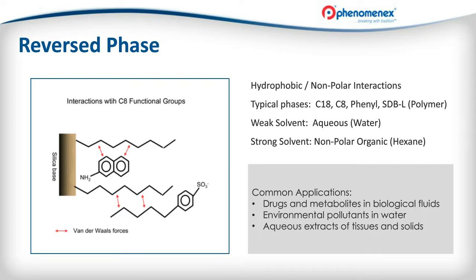The reverse phase SPE market is still the biggest. Not to say that it is necessarily the best, but it has a wide variety of applications in terms of environmentals, drugs of abuse, DMPK. Aqueous extracts is kind of where it is king.